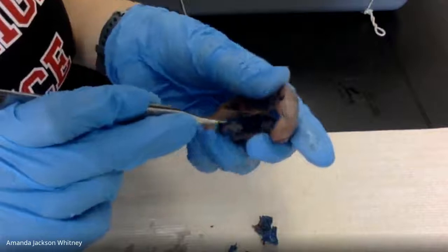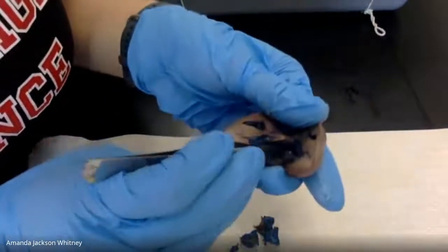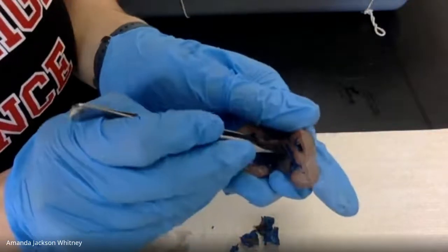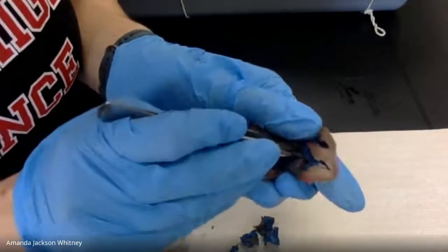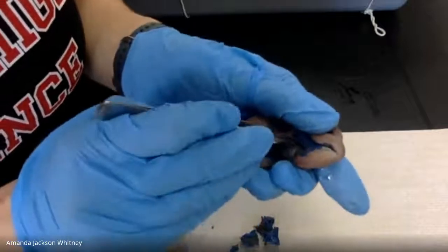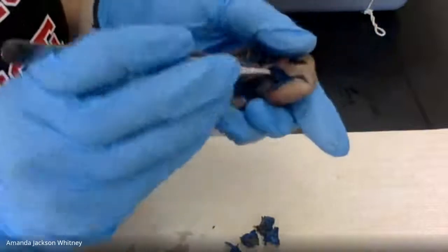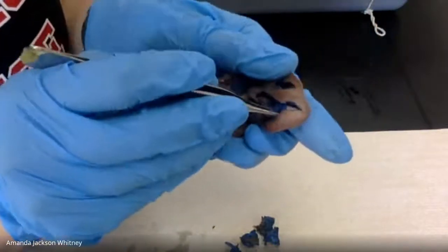You see all that latex? It's hard to get the latex out without really damaging the walls of the chamber, but I'm going to try as best I can so we can see it.